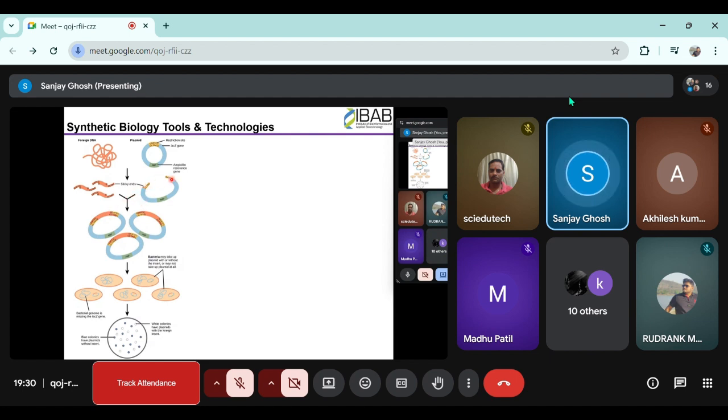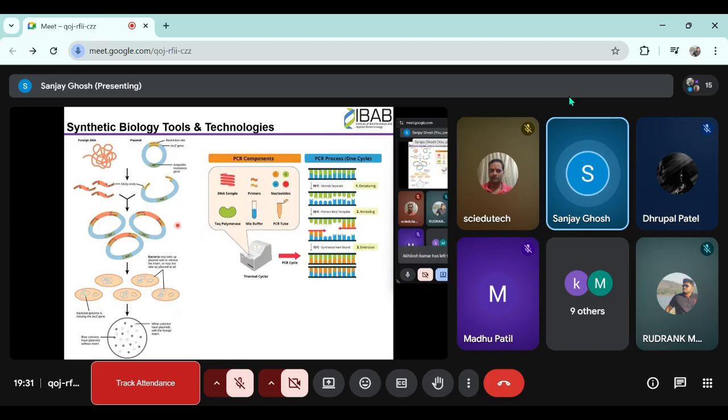And if you have not disrupted, that means it is an empty vector. The vector doesn't have your insert. So the cloning has failed. But if you have white colonies, that means you have a recombinant plasmid, and that is what you are looking for. So if you have done this experiment, you will see that depending on the ligation difficulty, you will have mostly blue, maybe a few white, right? So usually it depends on what is the frequency of ligation.